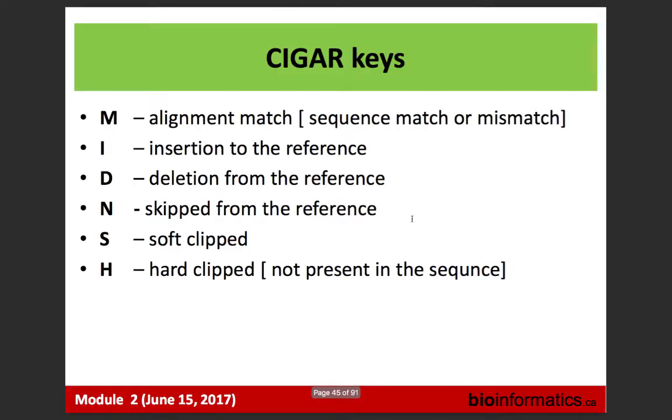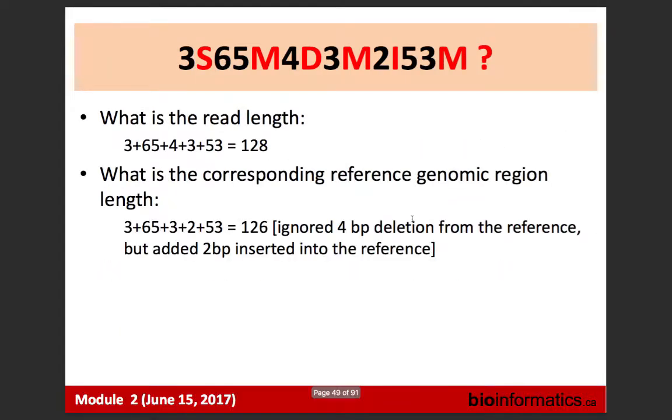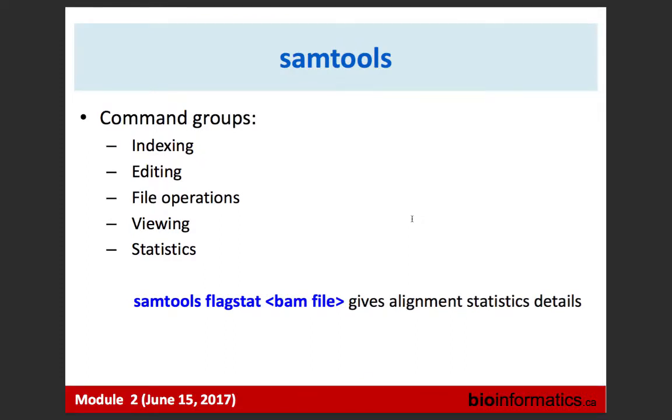CIGAR, everything, something you can play with. I put some questions about CIGAR; we will talk about this. Now, after we have this SAM file, the alignment file, we need some tools to analyze it. And some tools are very, very popular. Maybe some of you are familiar.